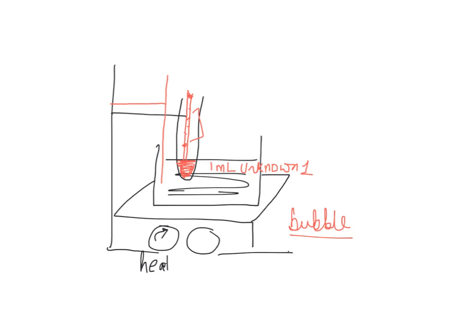So again, you have a water bath, you have 1 milliliter of sample, inverted capillary tubes. You have 4 unknown samples. You would make a table, you would tabulate that, and then you would carry on with the refractive index. So let's take a quick look at that.